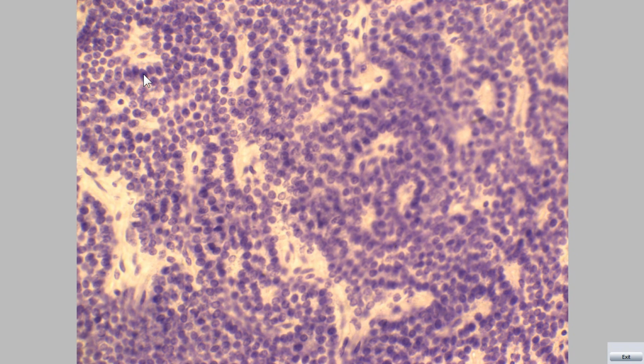All slides are stained by hematoxylin and eosin. Typical oxyphil cells appear heavily acidophilic, we distinguish them as very red.